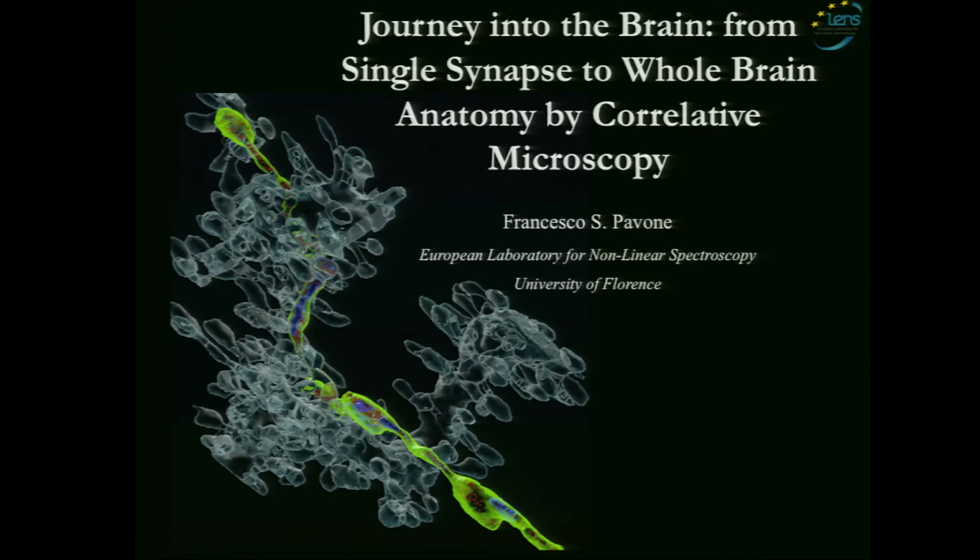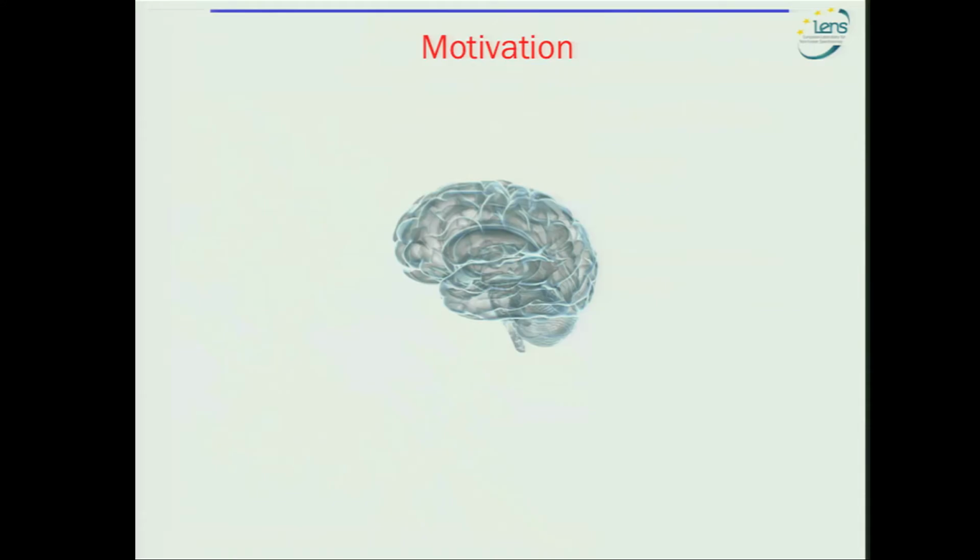So, I would like to talk about the possibility to use a sort of multimodal camera. Suppose I have to make a photo here, of all of you, and I want to catch all of you in the same moment. I want to have the possibility to zoom in and to see every single cell of your body. What I want to demonstrate to you today is that I have to use a multimodal camera, which is a sort of, let's say, correlative microscopy approach.